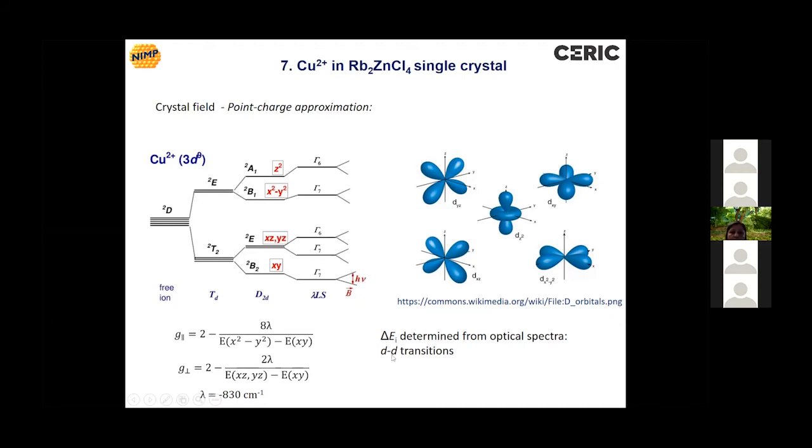So you can compare your theoretical model with the parameters previously found and decide if the proposed localization is correct or not, or if you make a more complicated calculus, including the molecular orbitals, you can use that comparison to determine the degree of covalency and the admixture of ligand orbitals in the ground state.